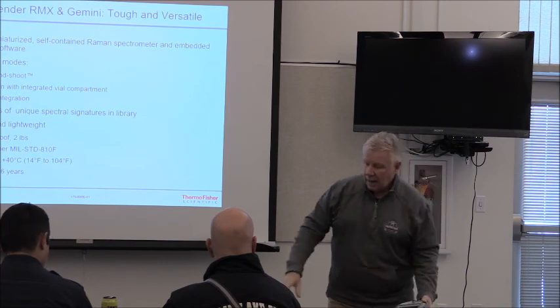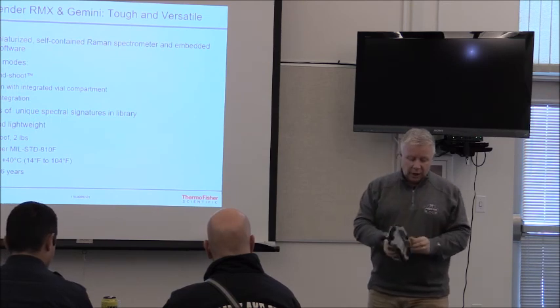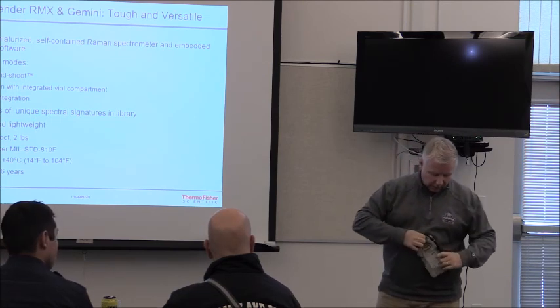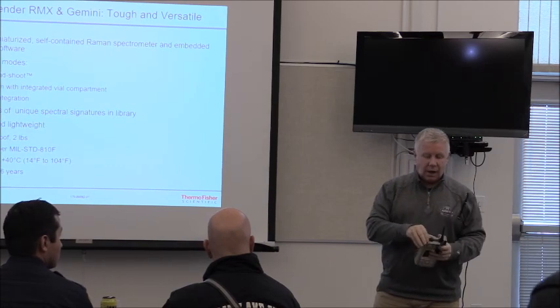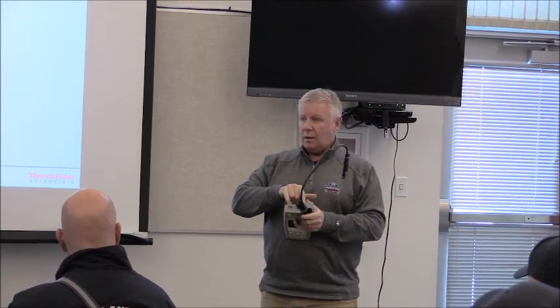Okay. The RMX has a third function. I don't think you will ever use it, but the third function on your RMX is a Talon robot integration. This top part right there is for the military's Talon robots. You don't have that on Gemini, just on the RMX. Unless you have a Talon robot, it has no functionality for you whatsoever. So if someone asks, what's this little port, can I use that? You just say, no, can't use it. We don't have a robot, unless you're in that position to get one. So that's your next purchase, try to get a robot. Robots are fine.